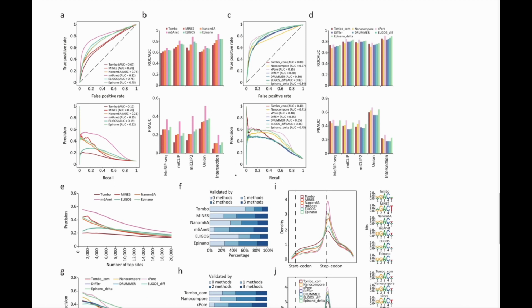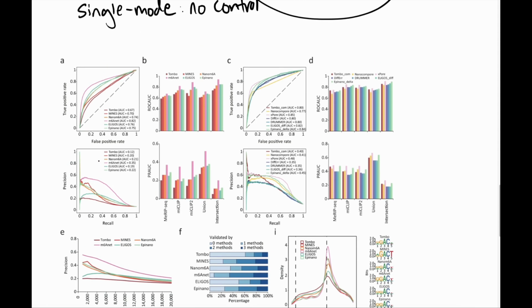And this here is basically figure 2, the summary panel of their results compared to the ground truth, which I mentioned is a combination of these different traditional next-generation sequencing approaches. And some of the high-level results, without diving into each panel specifically, are that m6a net specifically outperformed all of the tools for m6a detection capacity, as can be seen in the pink line here.